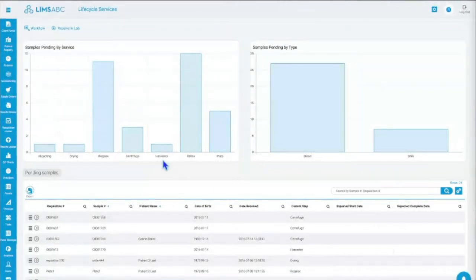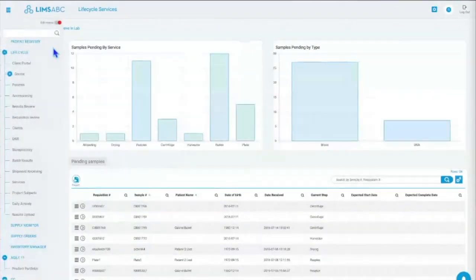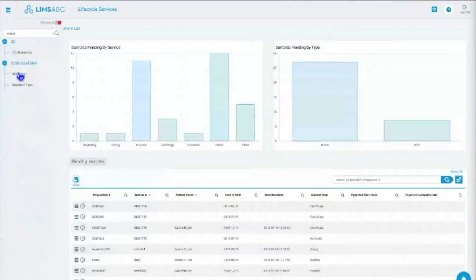We can define the material types generally, so a list of material types and a list of materials. All of that is fine. In terms of the setup, when you define a specimen, a test and a panel, we are usually able to define collection and testing containers. Those are actually materials.